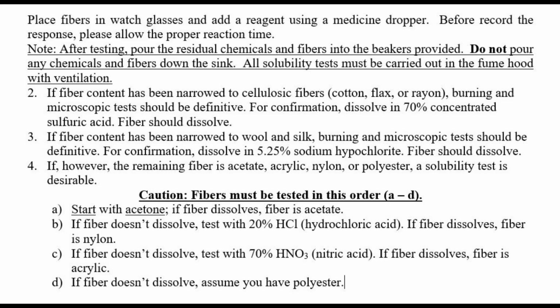From there, you will compare the chemical test results with observations you made earlier. By comparing all the findings, visual inspection, burning characteristic, microscope view, and chemical solubility, you will be able to make a final conclusion about the fiber's name.